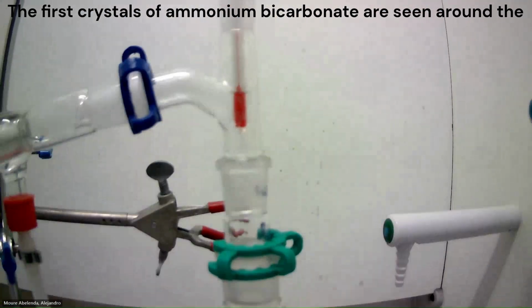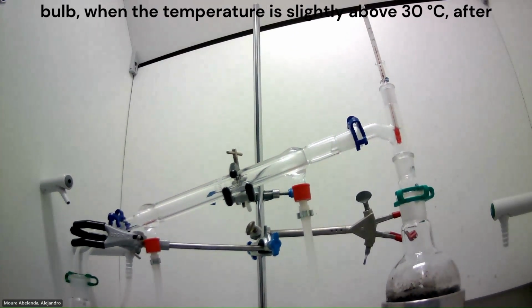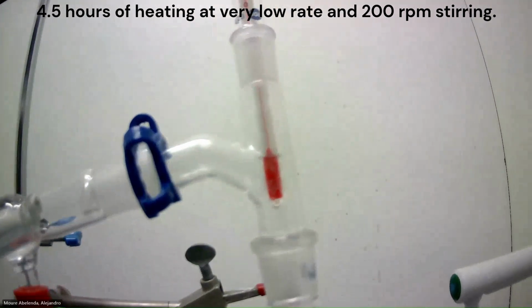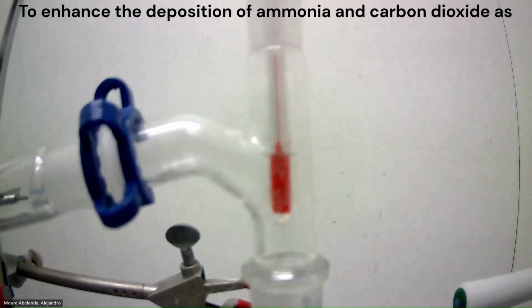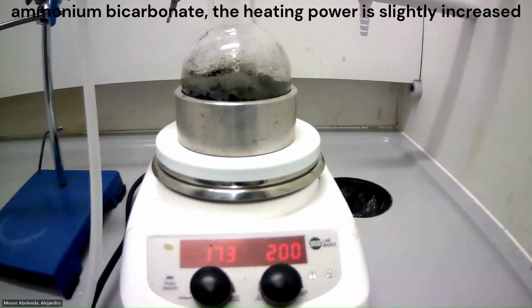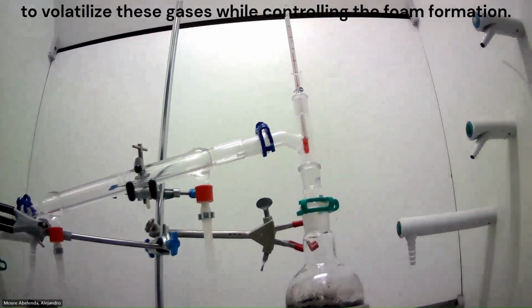The first crystals of ammonium bicarbonate are seen around the bulb when the temperature is slightly above 30 degrees Celsius after 4.5 hours of heating at very low rate and 200 RPM stirring. To enhance the deposition of ammonia and carbon dioxide as ammonium bicarbonate, the heating power is slightly increased to volatilize these gases while controlling the foam formation.